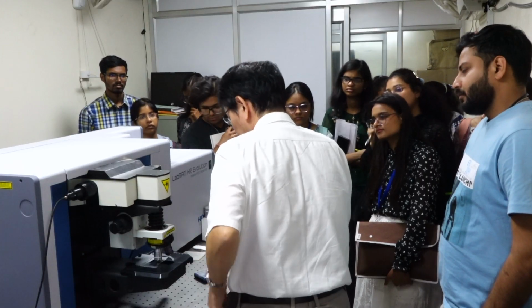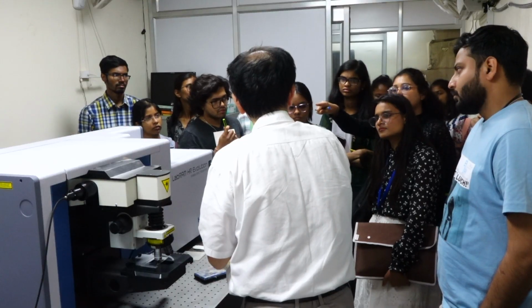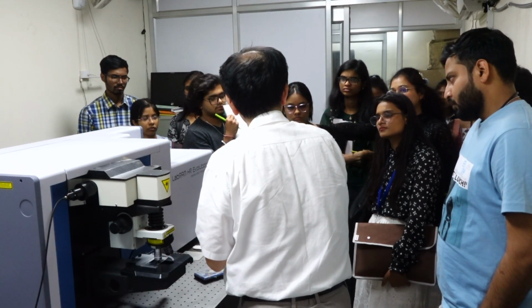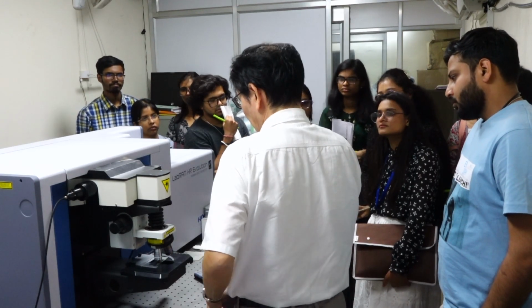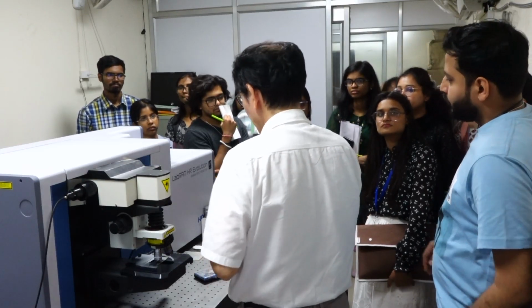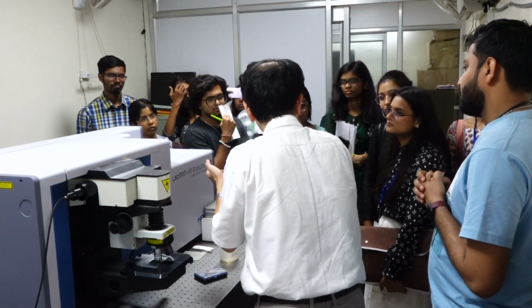I mean, you want to deliver all the signal into the detector. Yeah, because the mirror will work there, no? It will separate the desired light. It will go to the detector. Why do we correct the signal only there? You mean scattered light goes everywhere, but only the upper half is detected?